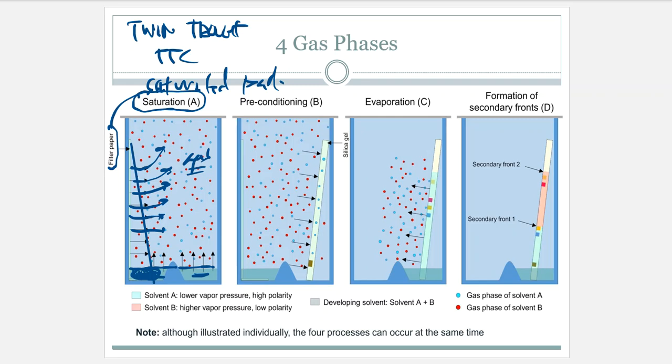If we're using a machine, an HPTLC instrument, there is very often a saturation step that we can do some settings on, and this is the step we are referring to. For the most part in HPTLC, the saturation step is, give or take a little bit, 20 minutes. That is normally what we see in the methods.